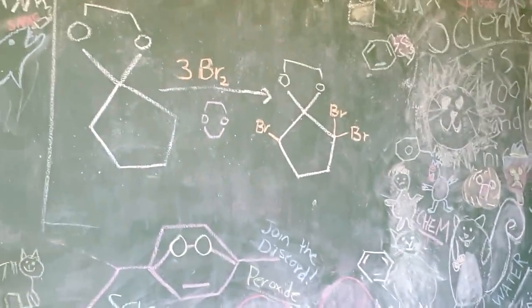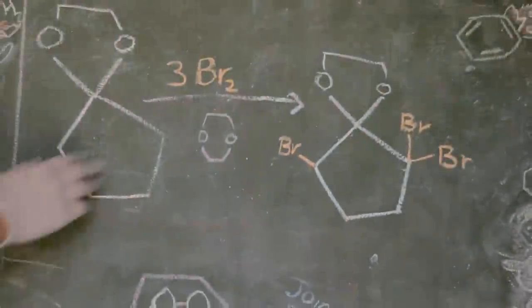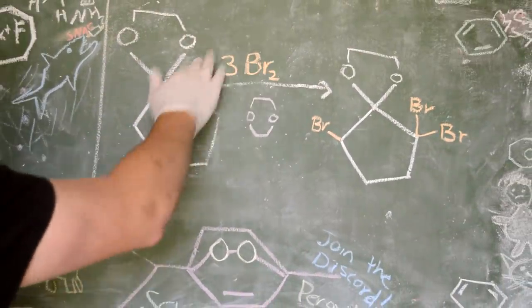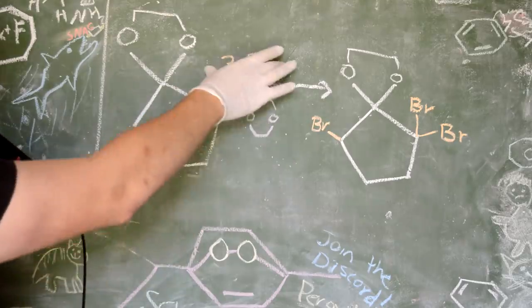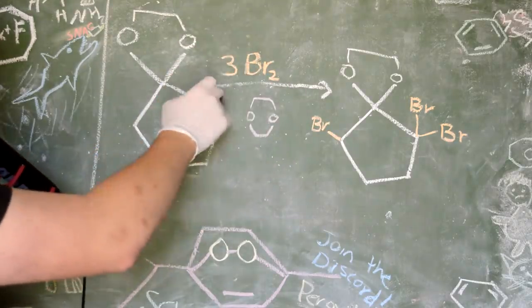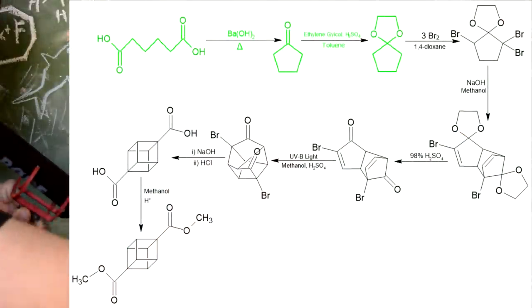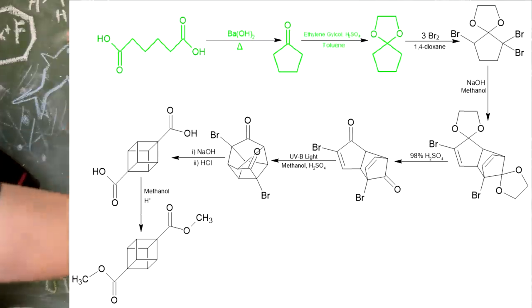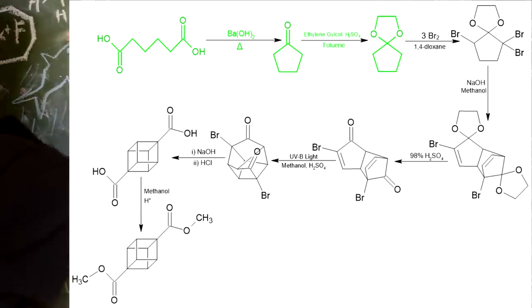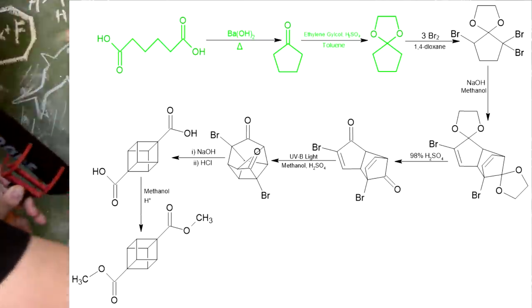So what have we got planned for today? Let's take it away, other camera. We've seen this reaction scheme before, in fact, this exact one last episode. But the difference was last episode, we didn't actually have these reagents and we made them last episode. So now we are in possession of everything we need to be able to do this reaction. So we're finally doing it. We're turning our cyclopentanone ketal into the tribromo cyclopentanone ketal using elemental bromine and dioxane.